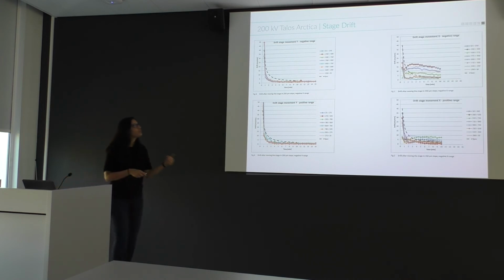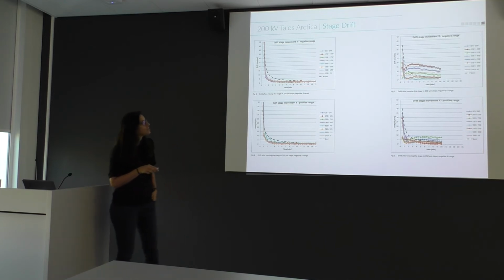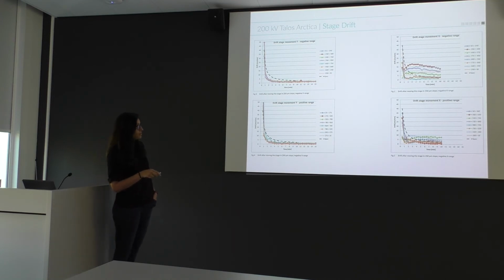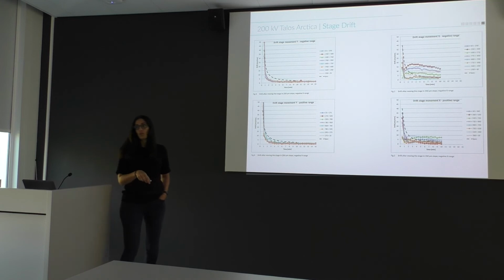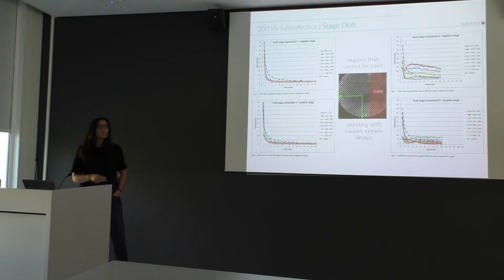But if you move it in the X direction, this is not the same. Of course, there are differences in which regions you're moving it. You actually then have a severe stage drift appearing, which is way above or way below the actual specification. So it's worse than you would want, and it's very bad because, you see it here, it would take more than 10 minutes to still not have gone down to where you would want it. So this is something that really limits it.